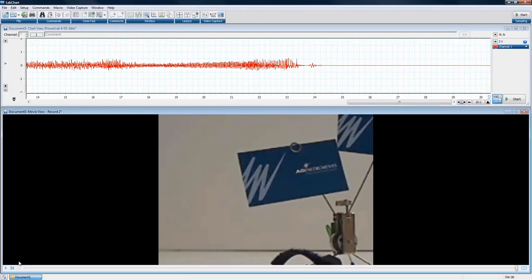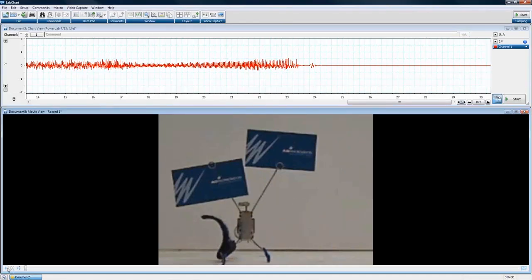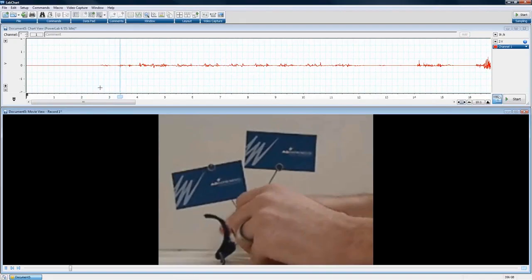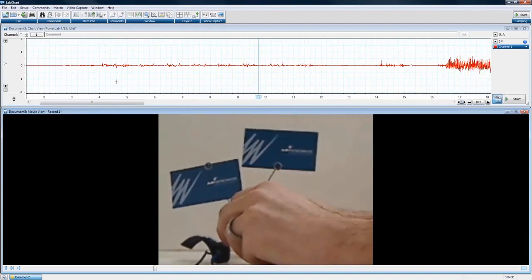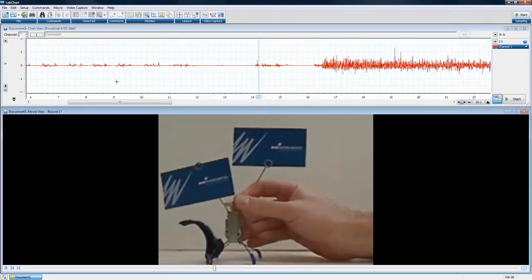If I want to go ahead and go back to the first one, we can click. Now we're back to the beginning of the first one, and you'll see the movie marker has moved forward, and we're at our first video again. So once again, this is how video capture can be used to move through the different points in the video file.